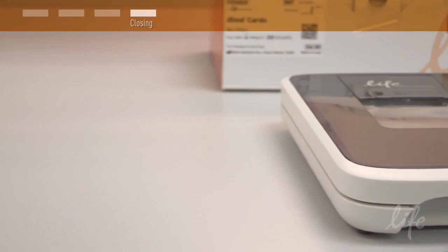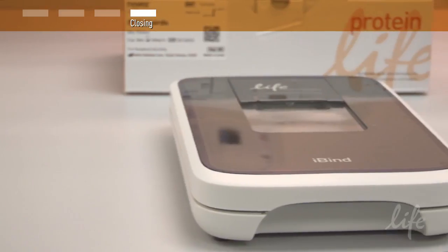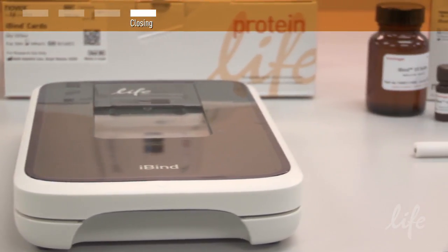For a hands-free walk away and reproducible Western blot, try the iBind Western system.